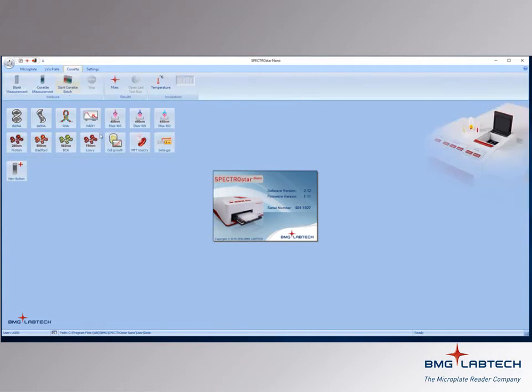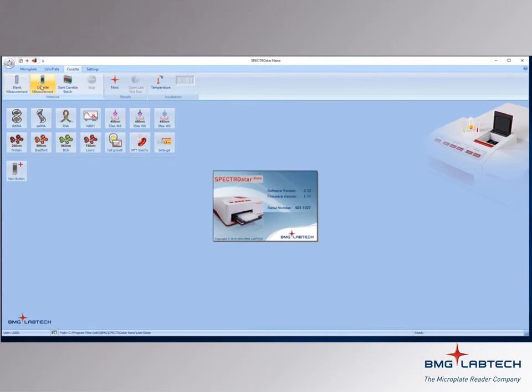The QVET tab also has predestinated protocols and some functions particular to this mode, including blank measurement, single QVET measurement, and batch QVET measurement.